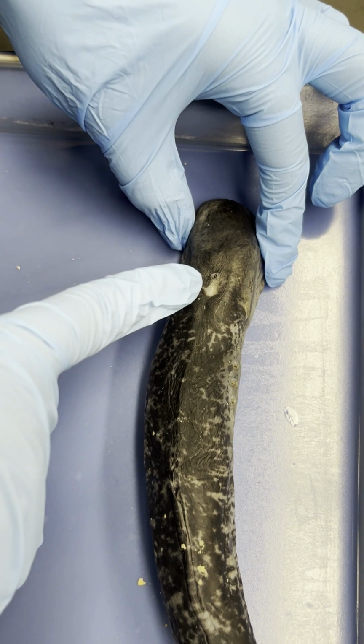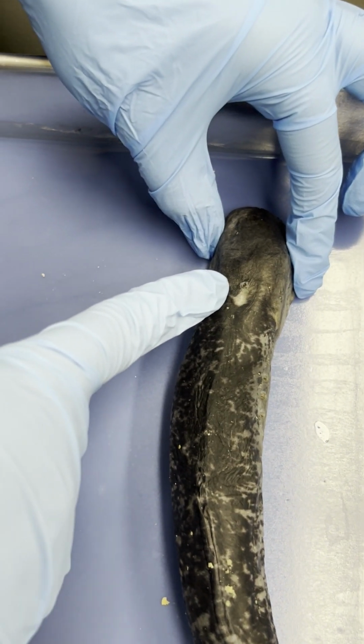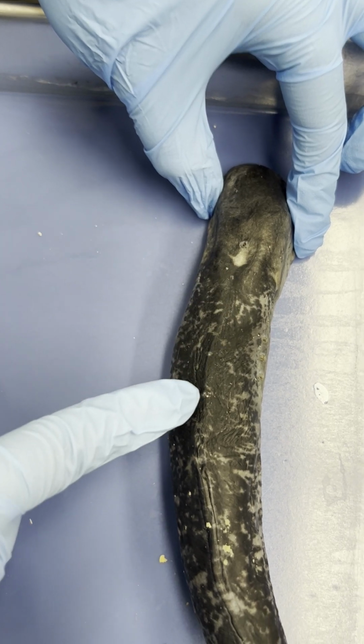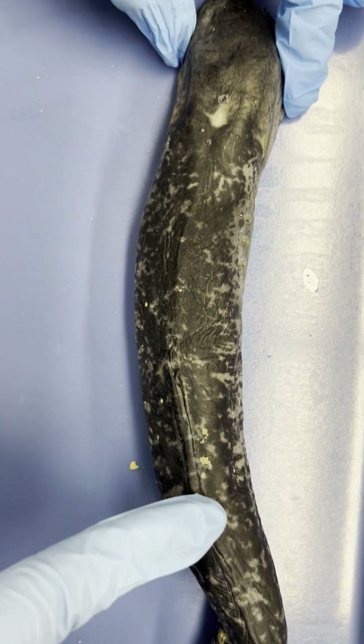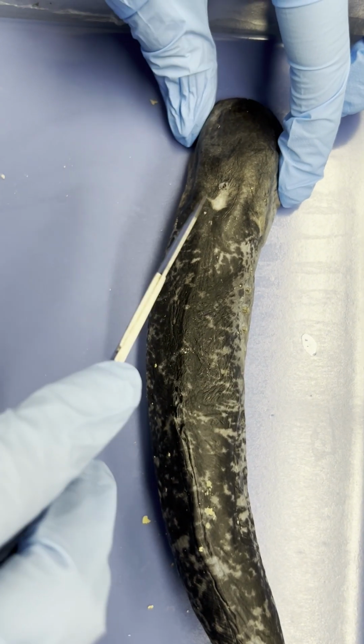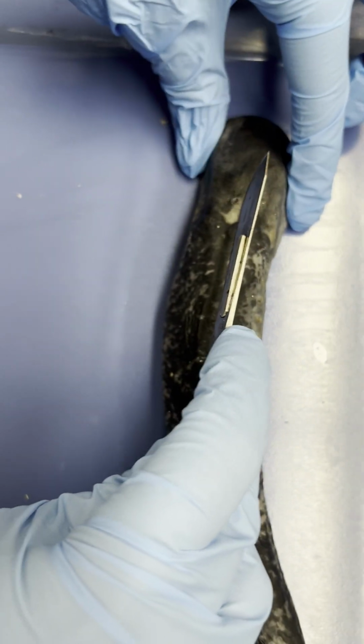When you're using these structures that Dr. Mason just talked to you about, that can really help guide you, as well as going along where the fins are will help you as well to stay on track. It's not going to be perfect, and don't stress too much, just try your best.